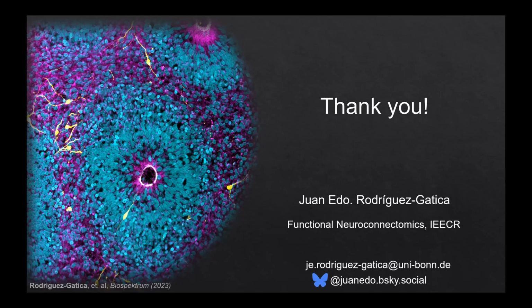Thanks. I have a question. Is it okay to ask? Yeah. So, brilliant talk, excellent images. I enjoyed it. How do you stabilize your samples for imaging? We were trying to do light sheet microscopy here, or expand the specimens with our collaborators to be smoother. We're trying to improvise, but how do you stabilize them? Because your images look spectacular.